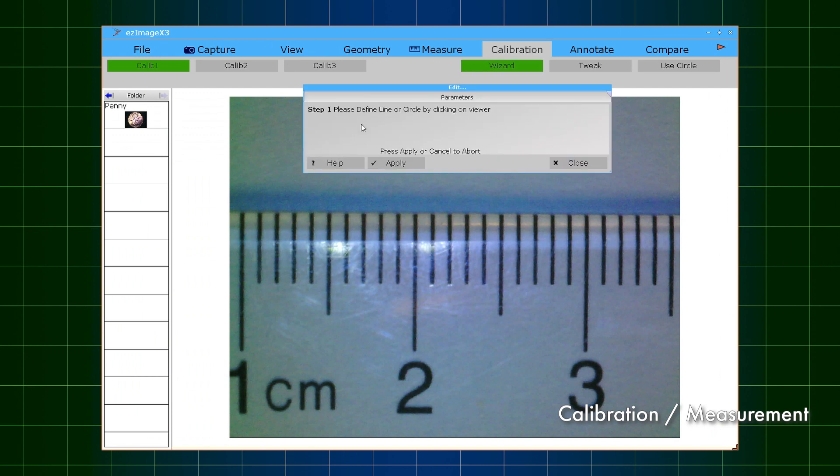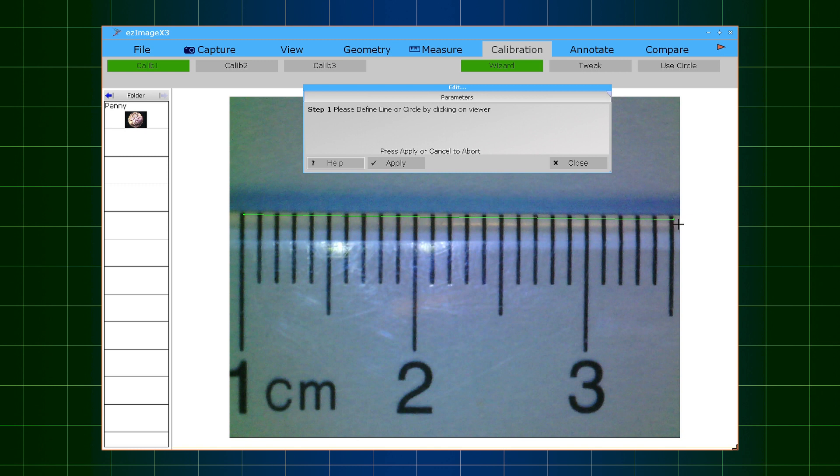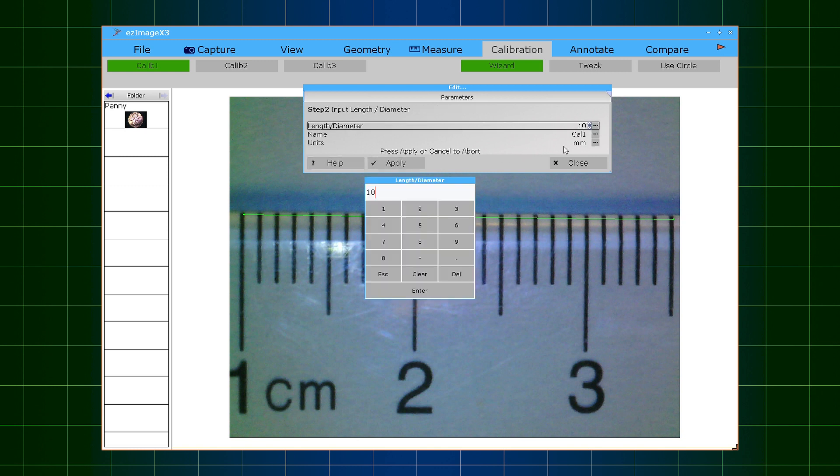Calibration and measurement. Easy Image X3 provides easy-to-use calibration tools. Once calibrated, Easy Image X3 can generate measurements using lines, circles, or angles.